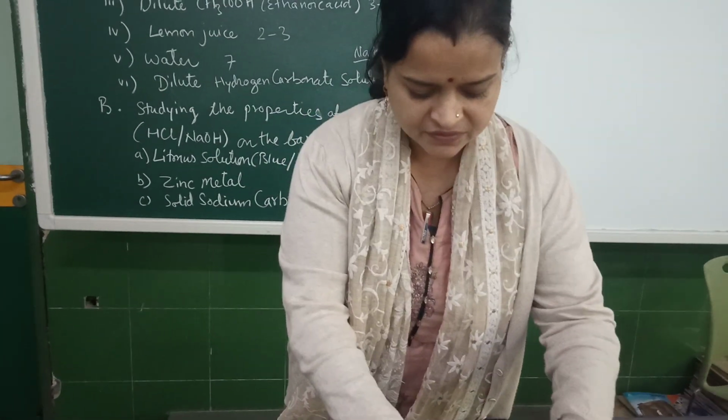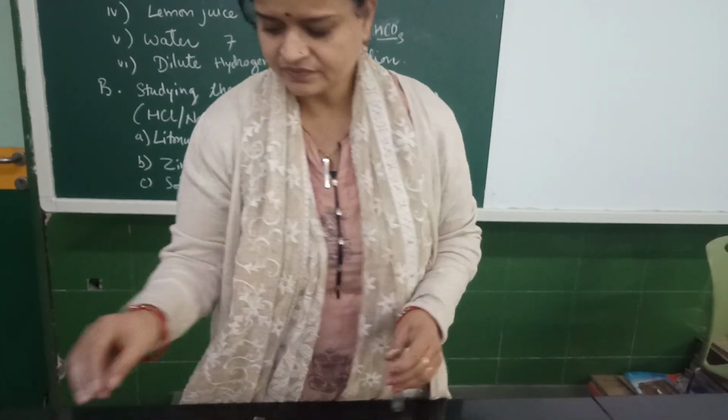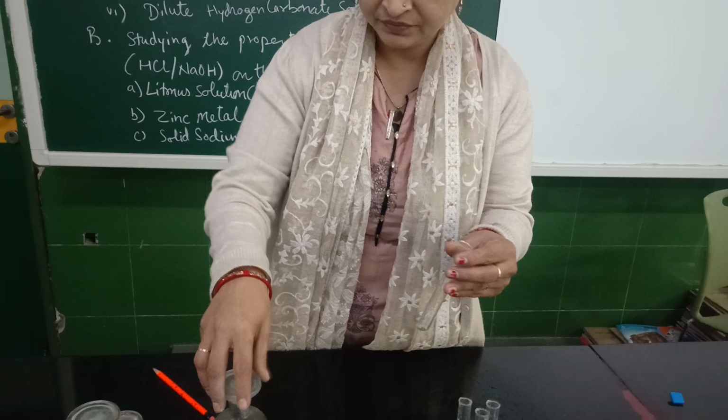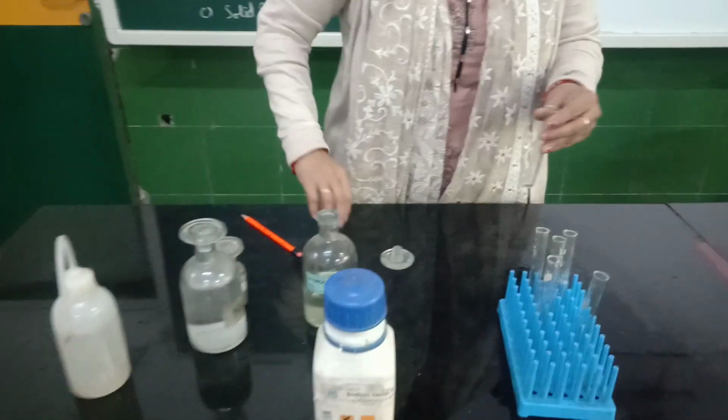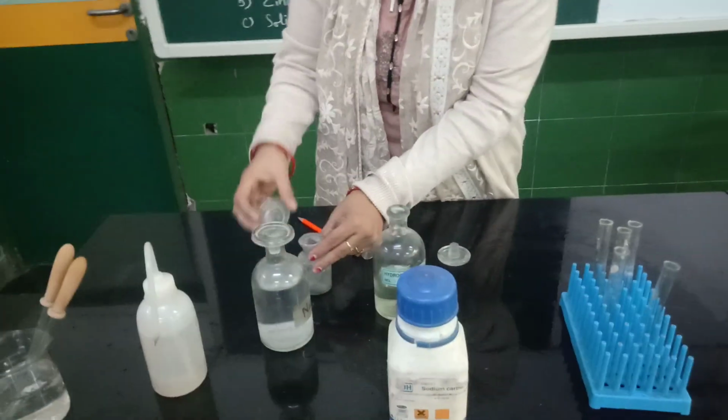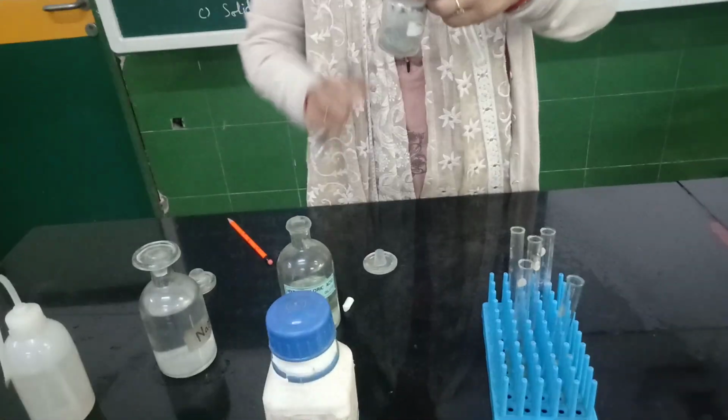Okay. I am taking a little amount of HCl. Let me just take zinc first. These are zinc granules.